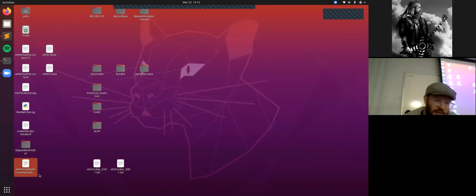Here's the file it generated. Some of these things are weird, in the sense that sometimes when you run it, you'll get a clear sign that it's running. Other times you'll run it and it will just go "burp," and you're kind of like, what, did it work or not? But here's the output file.